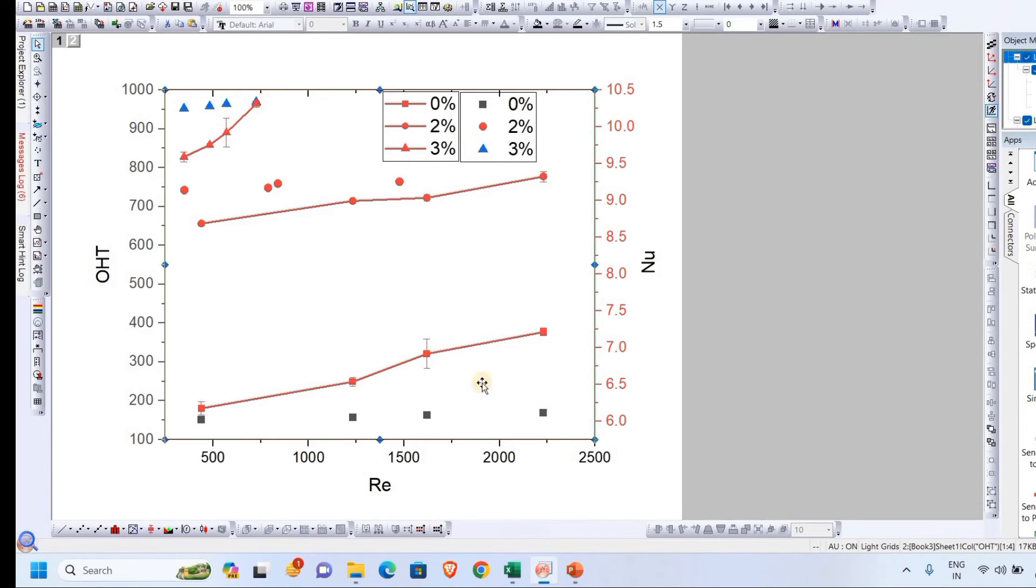Once we apply it, as we can see, it has been changed to scatter. We can change the color, no issue, later on. This is how we can plot the double y-axis plot in Origin. Thank you so much.